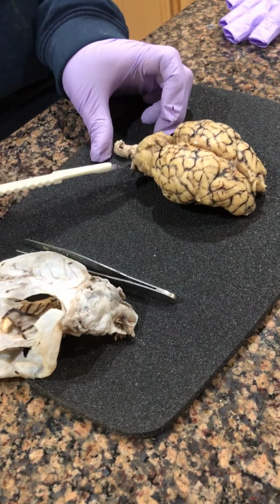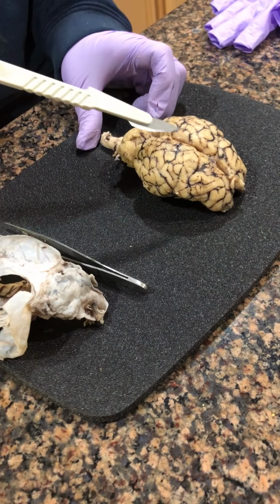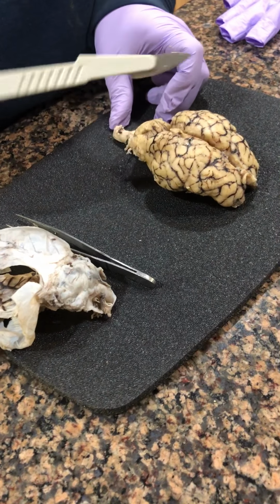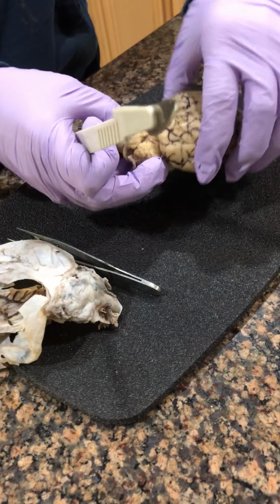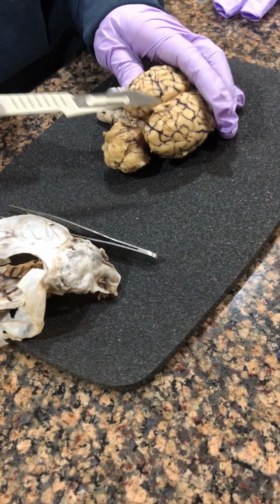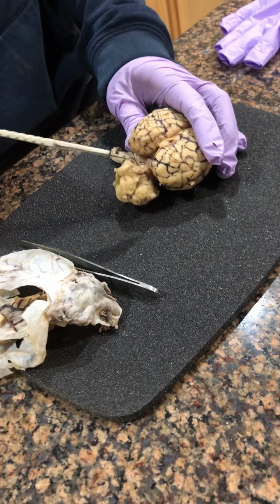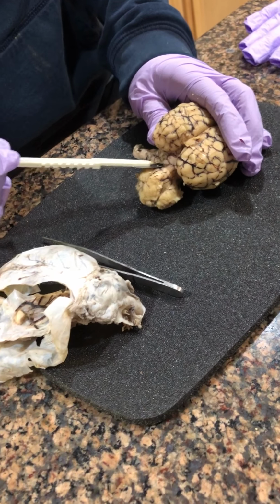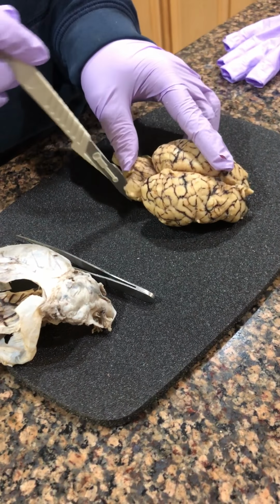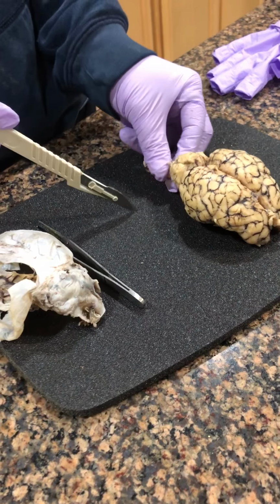The cerebellum is this piece right here. So your occipital lobe, cerebellum. The longitudinal fissure is going to be right in here, which is kind of your middle area right here. If I take it and separate it out this way, I would have my cerebrum up here. Your pineal gland is right in here. The corpora is this big piece in here. And this would be your cerebellum right here. Also, the longer piece would be the medulla oblongata, which also you can see on this part.